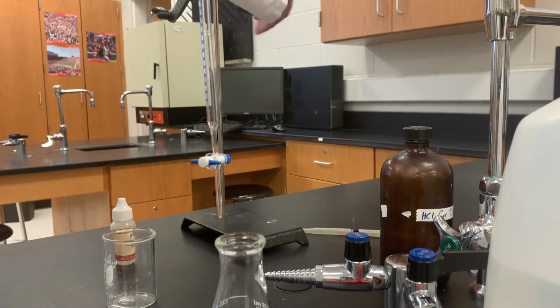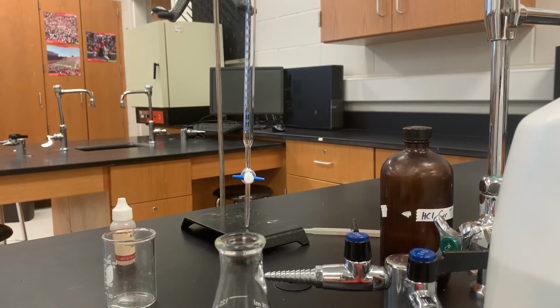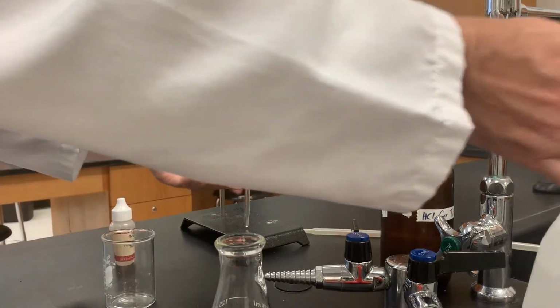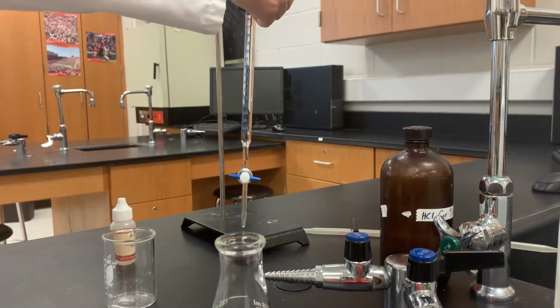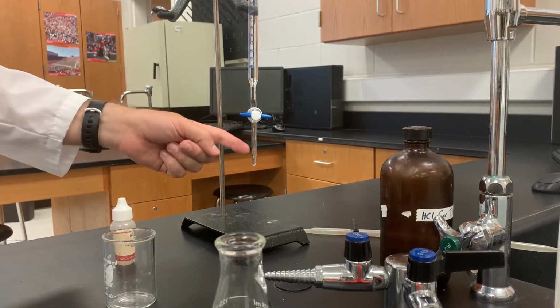And to use this properly, you put the burette in what's called a burette clamp, which will hold it in place. And then I'm going to use a burette funnel to fill the burette up with the stopcock closed. And I'm going to pour slowly so that I don't overfill this. And then before I can actually use the burette, I've filled it a little bit past the line, but there's no liquid down in the tip.